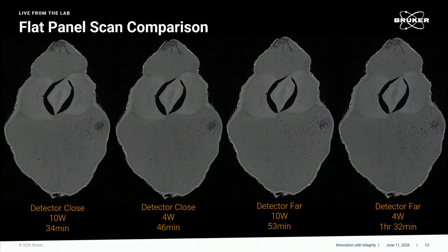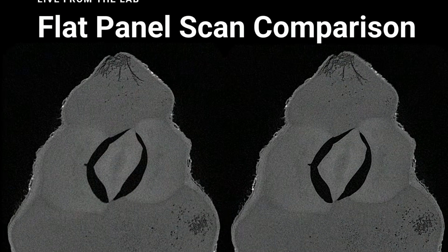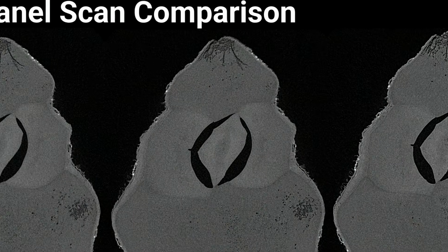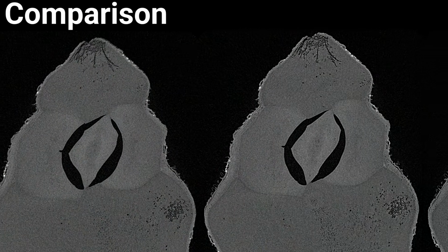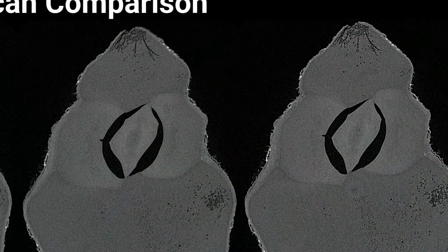But it's one of those where if you zoom in, especially on these features up at the top here, you can start to see some drastic increases in quality. Oh yeah, right there, especially between those two, I think we see a huge change. So this is from detector close to detector far.